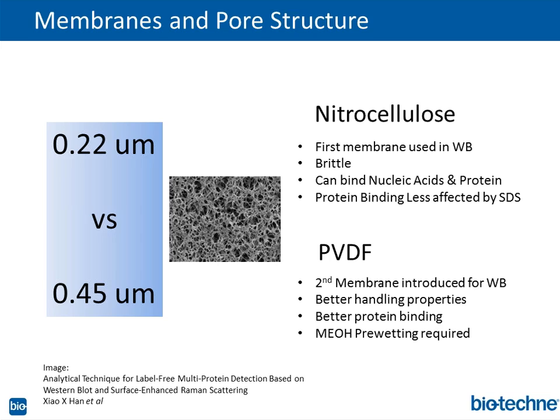And by the way, I know membranes are not very interesting. Membranes just sit on the shelf and people just use them when they're needed. But really, the pore structure, when you do blocking of a membrane, you've got to block all of that. There's a lot of real estate there to block. And that's where all the proteins are binding. That's where all the antibodies are going. So you should have a real appreciation for what a membrane does, because it's really critical in this whole process here.